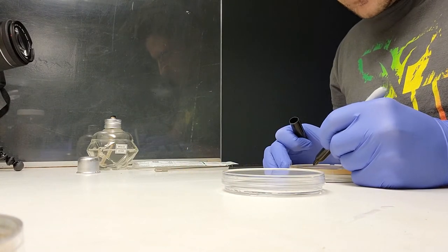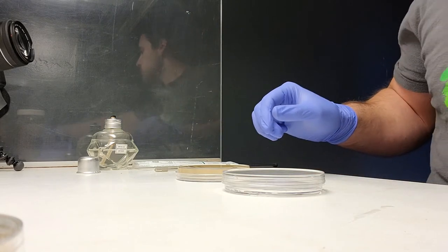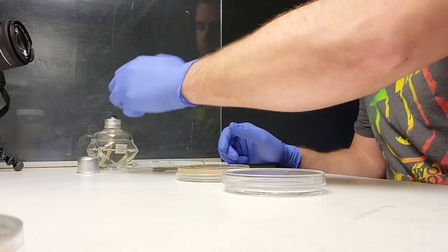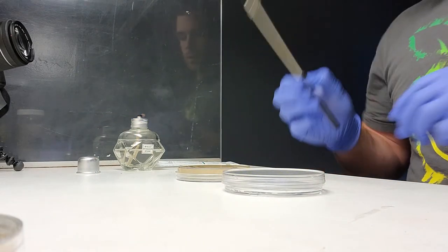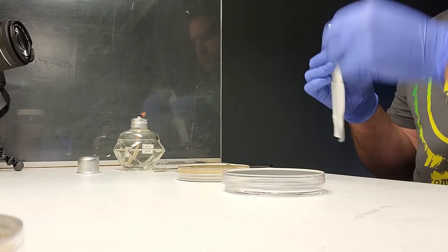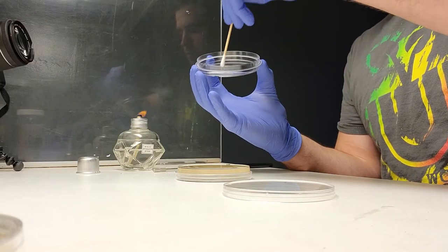I'm going to label my MEA plate 11-3-21 and label it 'ISO experiment.' I've got my fire, and I'm going to take my inoculating loop. I've got a sterile swab that is no longer sterile. Now I'm going to take this swab and pick up some of that mycelium — this is going to be dirty. I have my labeled plate and I'm going to streak it like this.